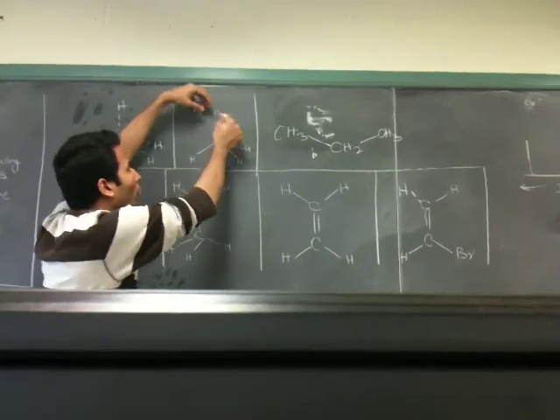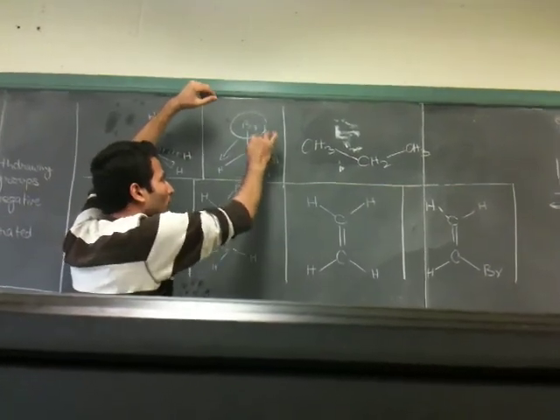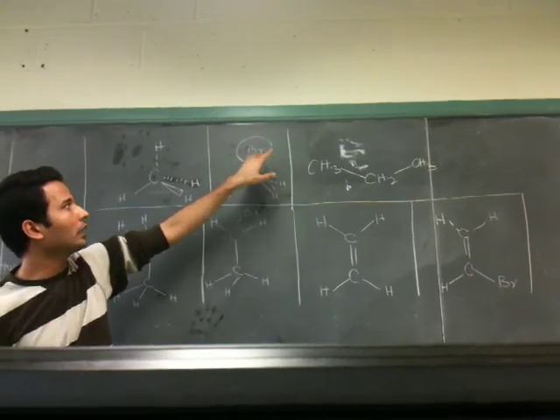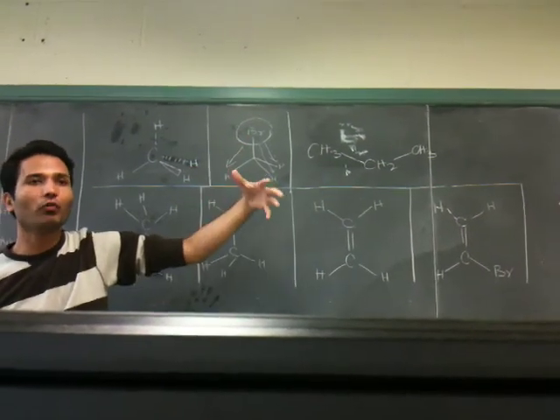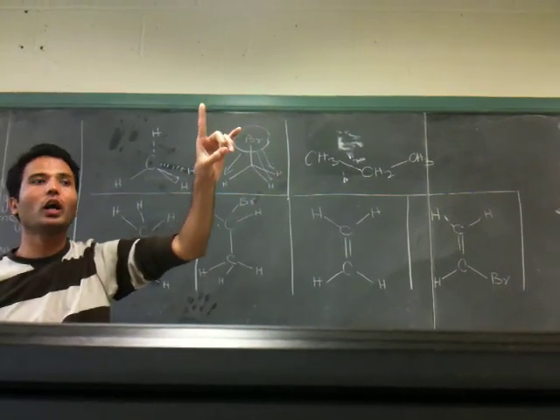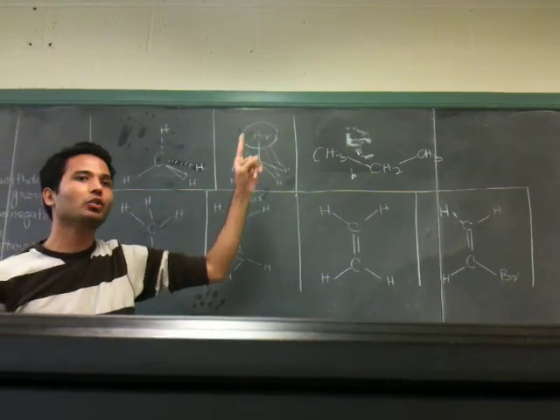Whatever effect this one has on this will be the same on this one, and on these. So these three make one set of protons, and all these protons are feeling the same environment because of this one. So single set. And if you remember your NMR spectra, the first question you got was CH3Br with a single peak at 2.1.